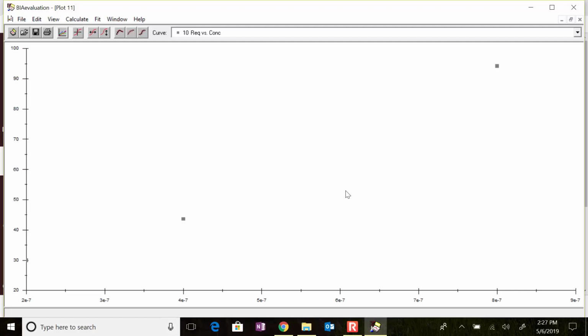And you can even get by with a 3 data point replicate like this if it goes together with the other data that you fit it with. Your job basically is to just do the fit the best you can and give me some numbers and some graphs. And I can go and fit them back in together myself later.